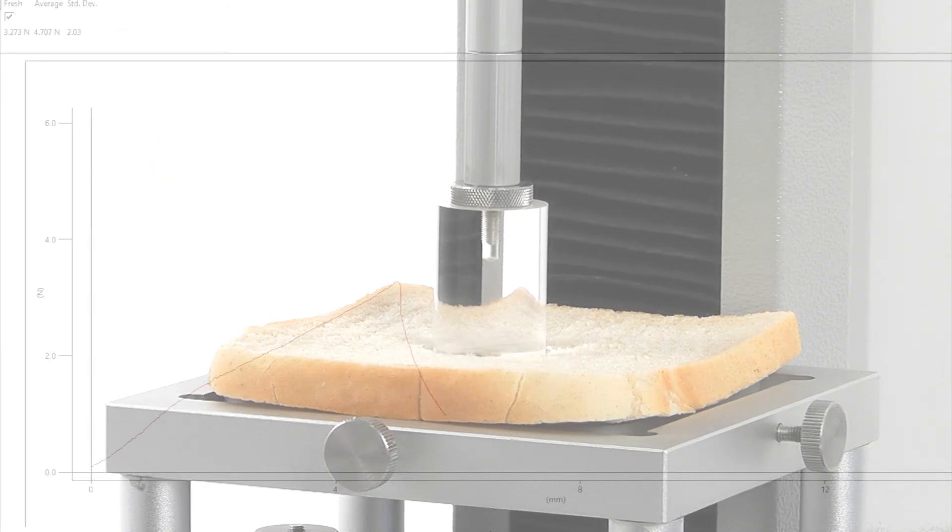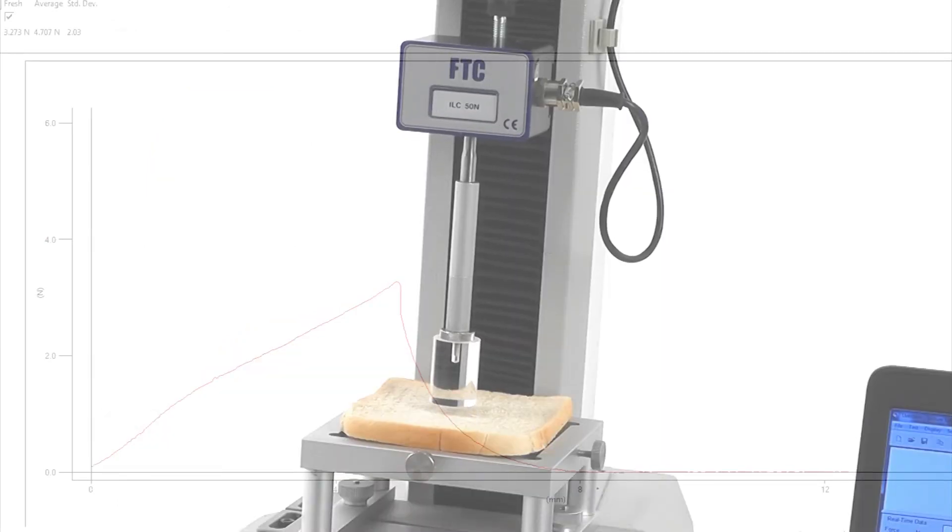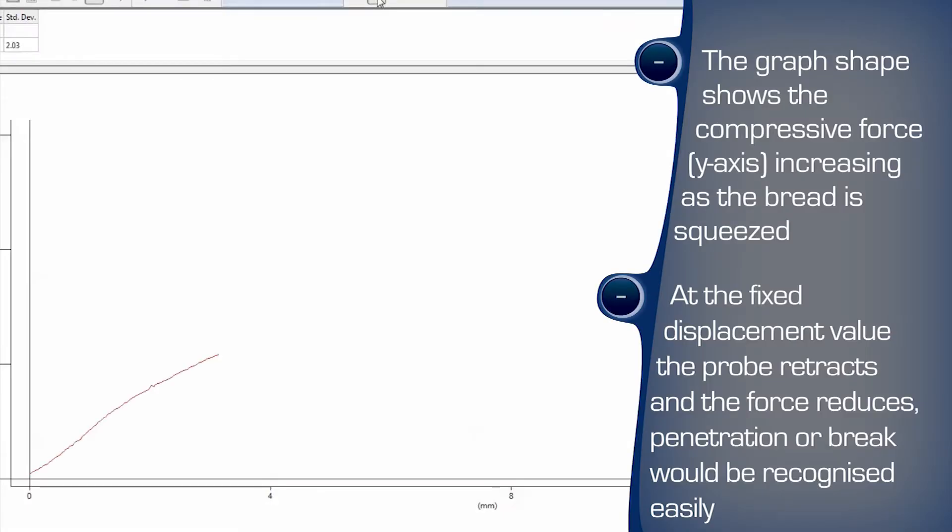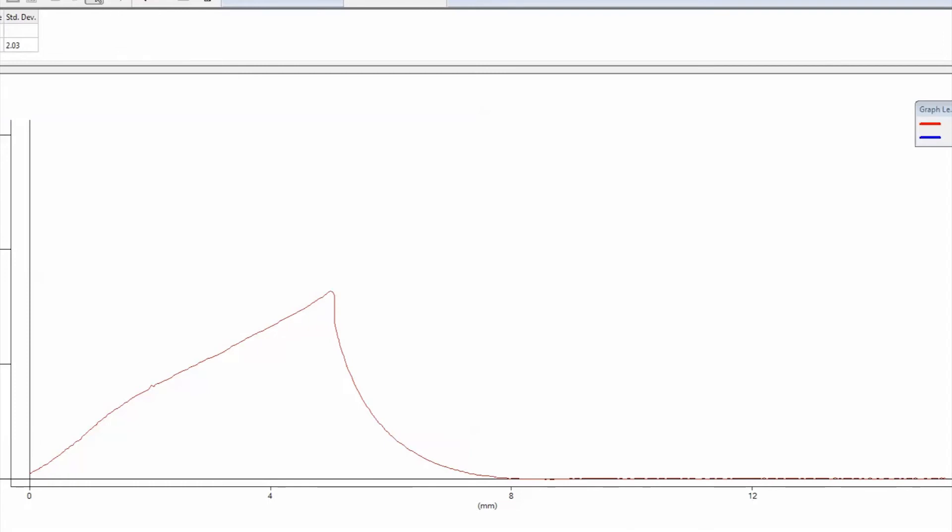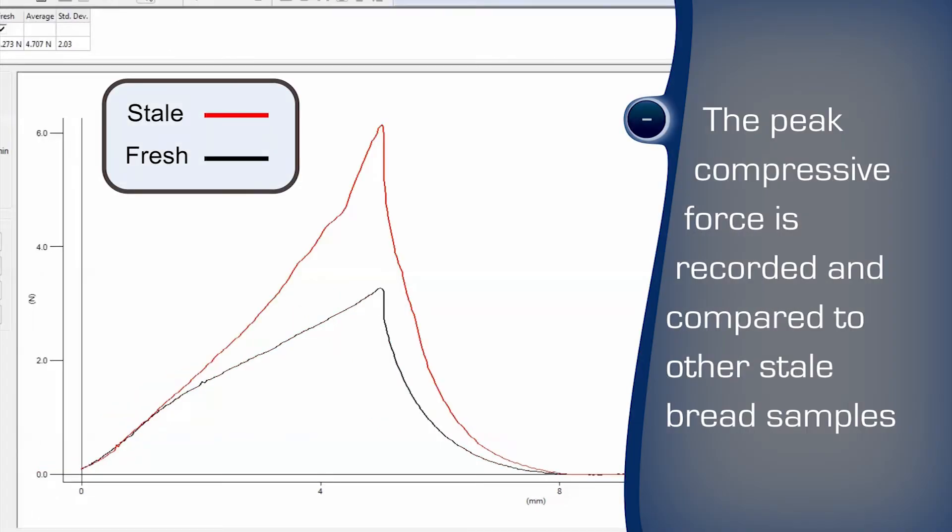The probe is retracted at the same speed to simulate a squeeze or bite. Real-time graphing clearly shows the behavior of the sample under test. Features of the curve can be identified which indicate ideal or undesirable sensory characteristics and the calculated values correlated to preferred quality benchmarks.